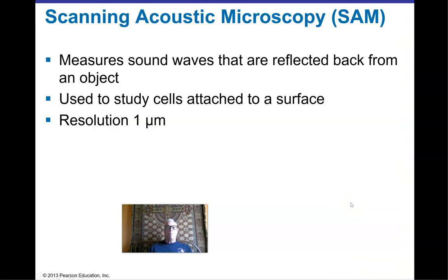I'm not going to spend time on some modern methods that use a microscopic tipped probe to resolve things down to the atomic level. They're not something that you're going to see in a microbiology lab. These are theoretical or research kind of grade instruments that are used for very cool stuff for observing the shape and position of things at the atomic or molecular level.